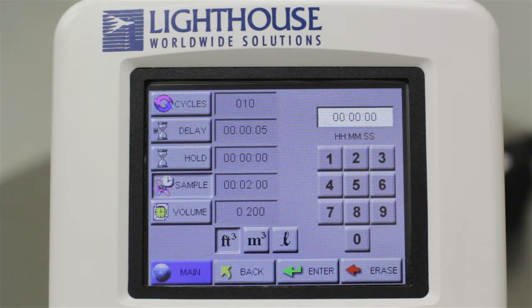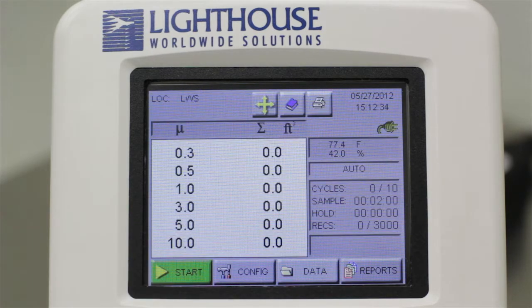Your particle counter will calculate volume in cubic feet, cubic meters, and liters. These are display values, and you do not need to press Enter when selecting your units. Once all the values are set, touch the Main button on the bottom left to return to the home screen. This sample configuration will stay in memory, and when you touch the Start button in the lower left, it will run the configuration you just set. The instrument's current settings are displayed on the right side of the screen in the gray boxes. You are now ready to start the first sample by simply touching the Start button.